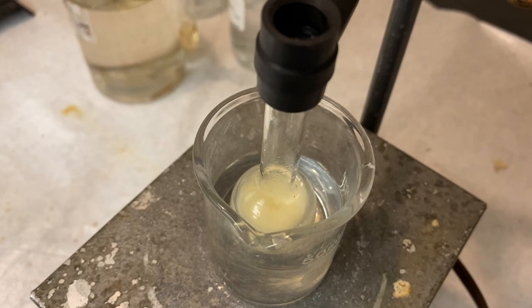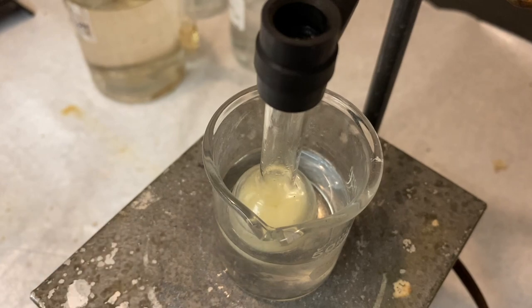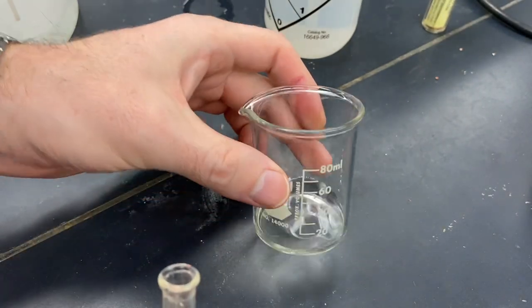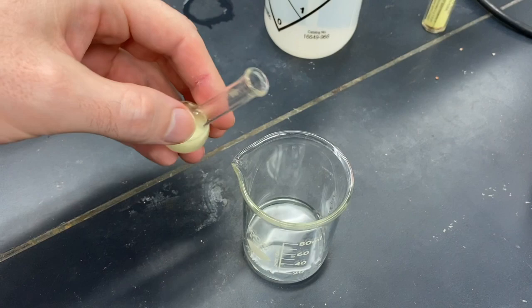And at this point, we're going to take that and pour this mixture into a beaker that has some ice cold deionized water in it. Here's our beaker with approximately ten milliliters of ice cold water.